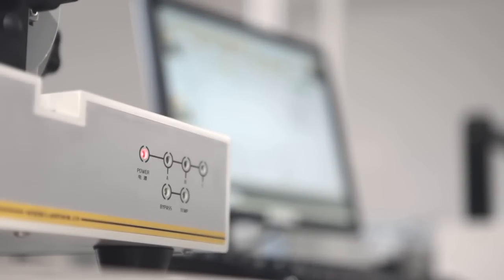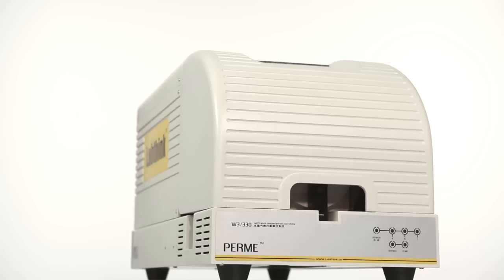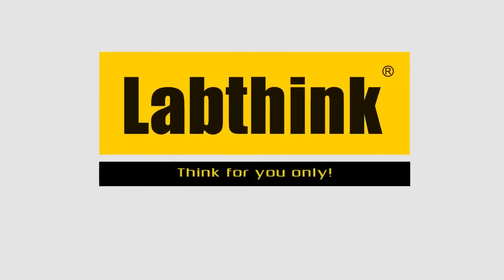The W3330 will then accomplish the test automatically. W3330, your excellent choice for WVTR testing system. LabThink. Think for you only.